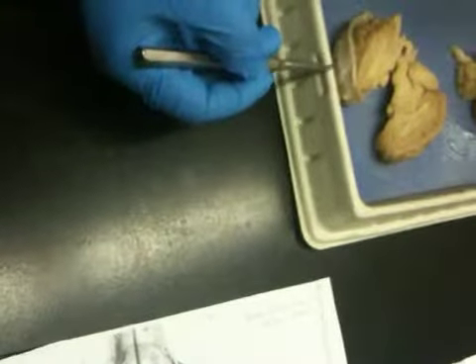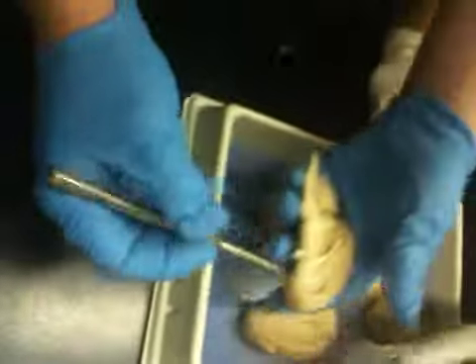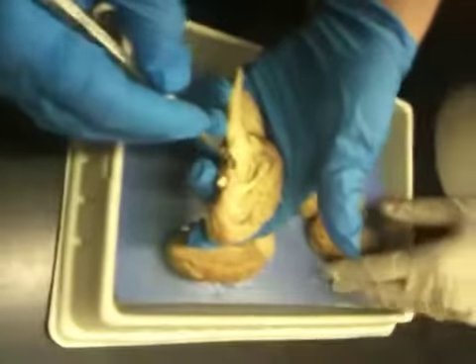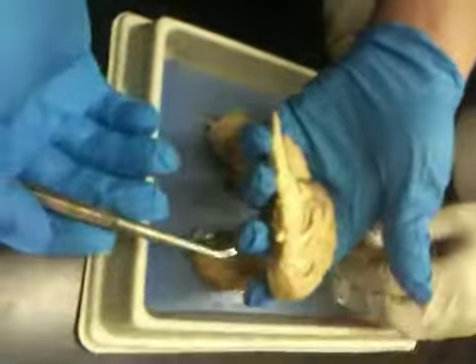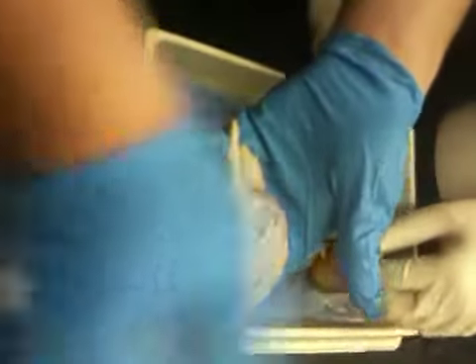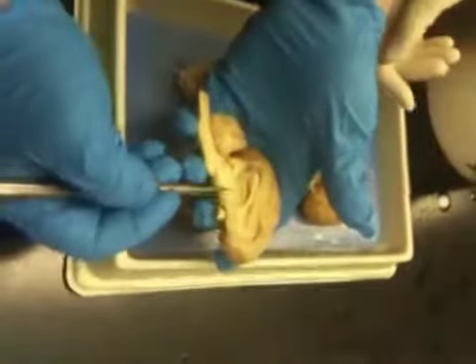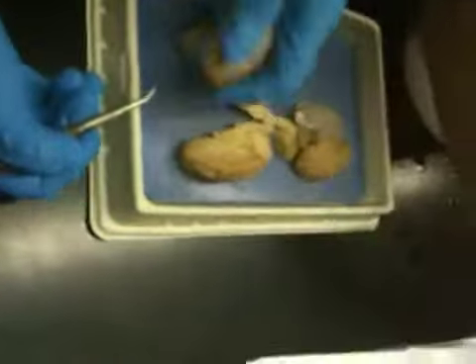What was the hypothalamus? Where was it? You said it was like here, right? The hypothalamus should be right around here. In the thalamus? They're connected, but the thing is, it doesn't show it in this diagram. He said it was around here. Both of them were? So that's going to be a pain to differentiate.